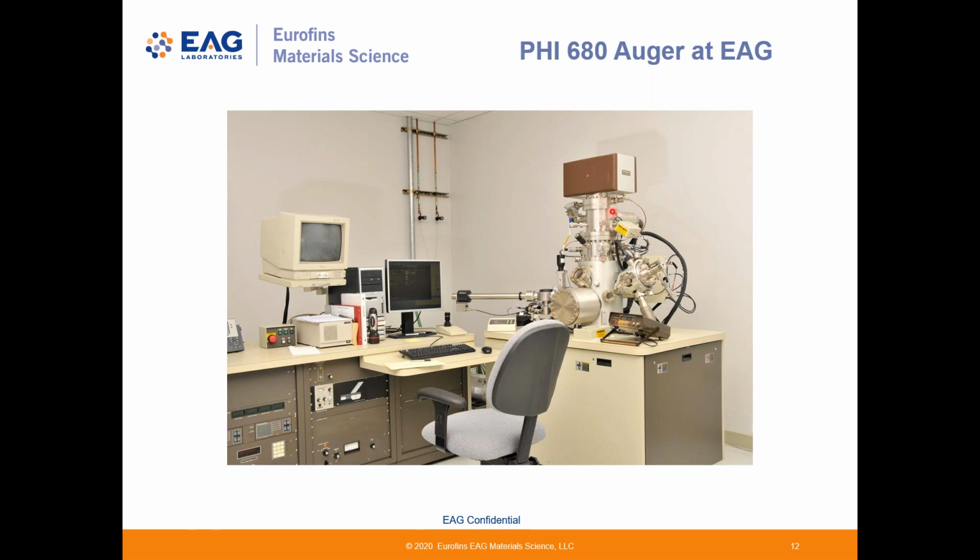Below that, you can see a couple of cylinders that house the electron gun and the CMA. There's a viewing port here to make sure you haven't dropped the sample after transferring the sample from the small intro chamber here into the main chamber with the use of this long transfer rod, which is coupled to this black handle with rare earth magnets. The large cylinder jutting out towards us contains the stepper motors and drive hardware to move the sample stage in 5 different directions. And then here is our argon ion gun with a thermally controlled leak valve here.